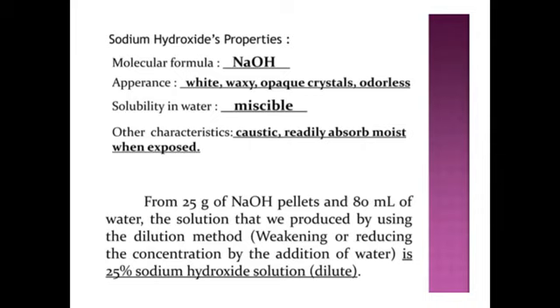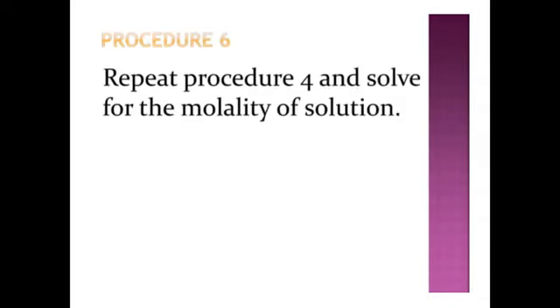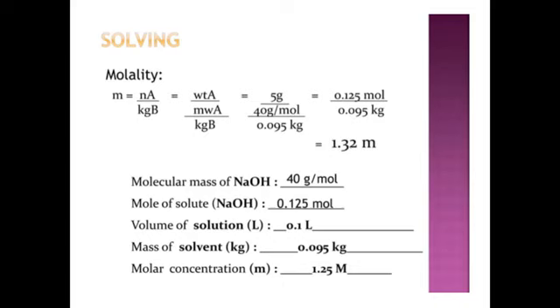So that's how to prepare a base. Any other base like sodium hydroxide, calcium hydroxide, etc. can be prepared using whatever information you have been given. Now, you can repeat procedure 4 that we did for the molality of the solution. This is how you do it if you are looking for the molality of that solution.